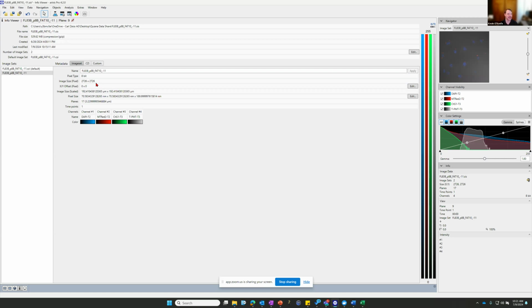I haven't run into an application where I've actually taken advantage of the offset. Usually I just reset it, because if you're doing deep learning or any segmentation, sometimes that offset can throw you off. There is a kill and run assay for people looking at tumor cells and T cells, where we're doing time-lapse tracking of those objects, and that offset slows it down a little bit. That's one application where you just want to reset this offset. Okay. Let me save that too.